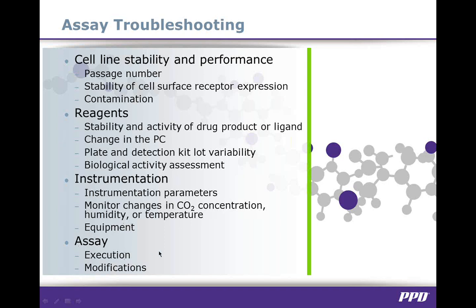The last category relates to assay format and execution: review the method and ensure that steps have not been modified. Ensure that changes in pipetting techniques or dilution schemes of samples and controls have not changed. Consider having the assay executed by a second or more experienced analyst to determine if there is analyst-to-analyst variability. Also look for possible matrix interference if not performed during the development process, and determine potential differences between healthy and diseased subjects, assessing potential matrix-related interfering components.